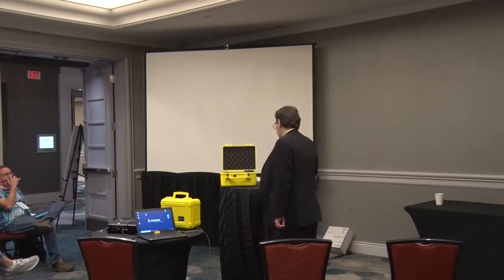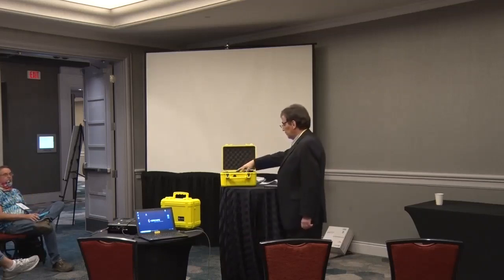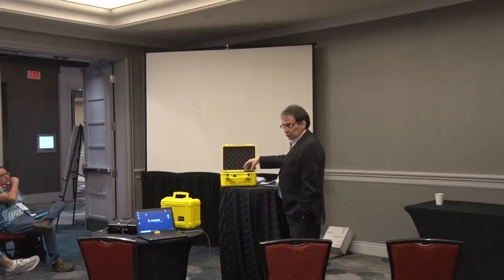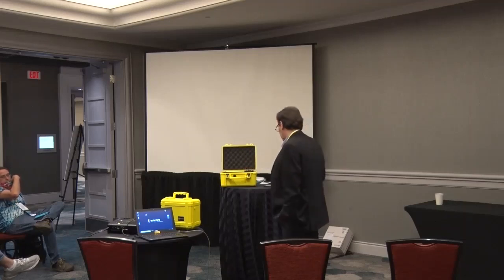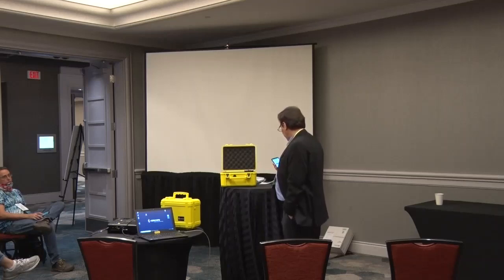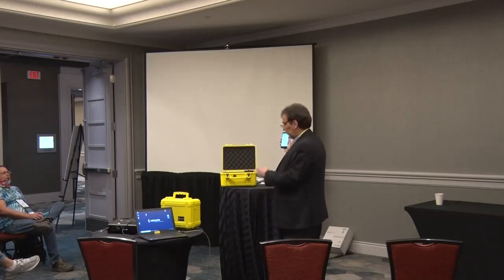So this is a counting instrument. The air flows through the cell, and whenever an alpha decays, it hits the side of the instrument and makes a flash of light, and that is one count on the counter. When you have the beeps on the app, you will hear a beep every time one of those events happens. Right now, you hardly hear beeps at all. Every few minutes or so, you'll hear one beep, and that's a count.